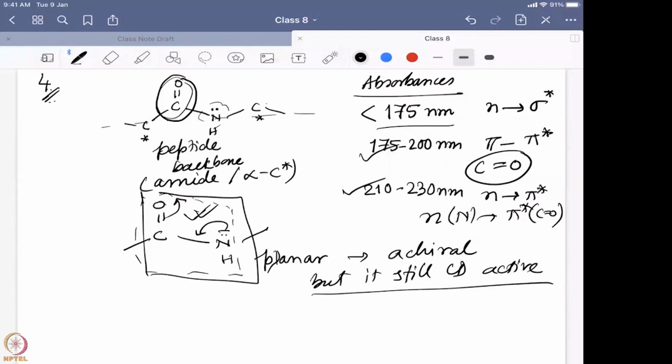So altogether, what I can say is that the alpha helix and the beta sheet obviously put strain on that, affecting how it behaves and how it orients, but they are not really stripping it of its planarity. So whoever wrote those particular answers, they got 8 out of 10.